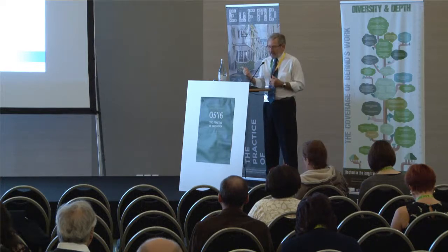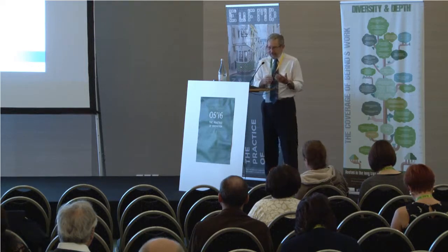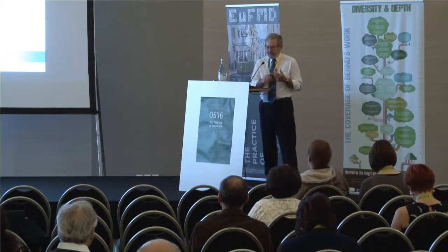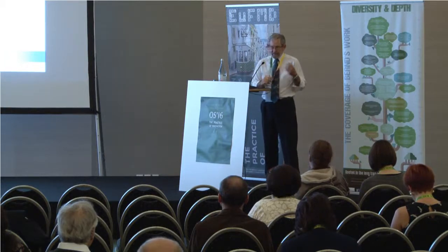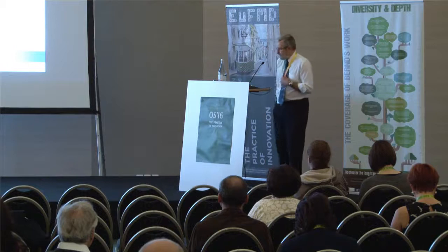Collection of oral swabs from sheep is easy, pooling is not difficult, but if you're in a developing country, think about this differently. Labour is not a problem, so you can pool your samples easily and run your PCR, but now you might be doing one PCR for 30 animals. What appears to be expensive in real-time PCR reagents will become much less expensive for you, just as in the developed countries, labour is expensive, and so pooling helps to keep the cost down.